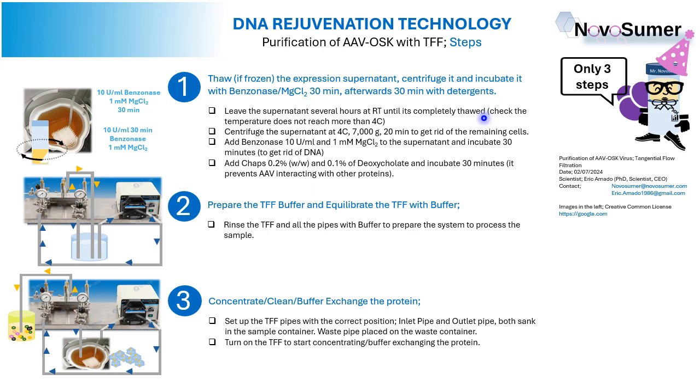Okay, so this is the first step, just centrifuging and incubating first with benzonase for 30 minutes and afterwards incubating with detergents.